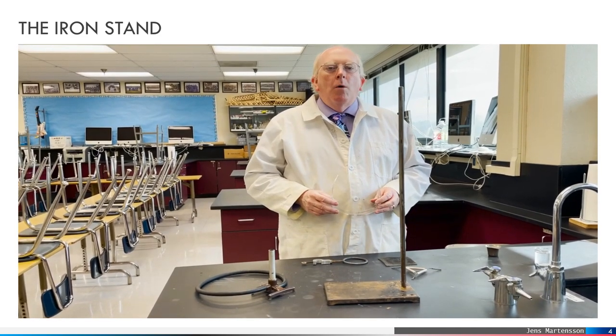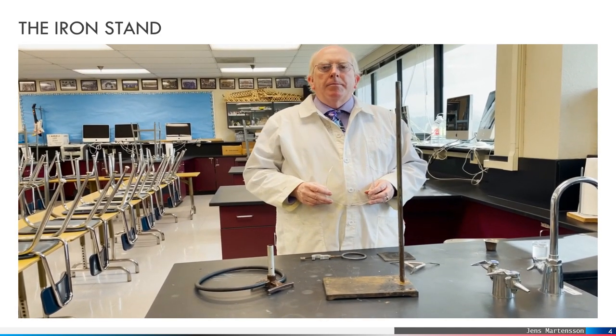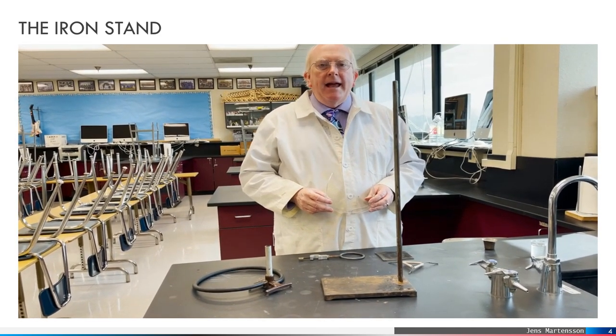Hey everyone, Morgan here. We're going to be talking a bit today about the proper use of a ring stand and ring.